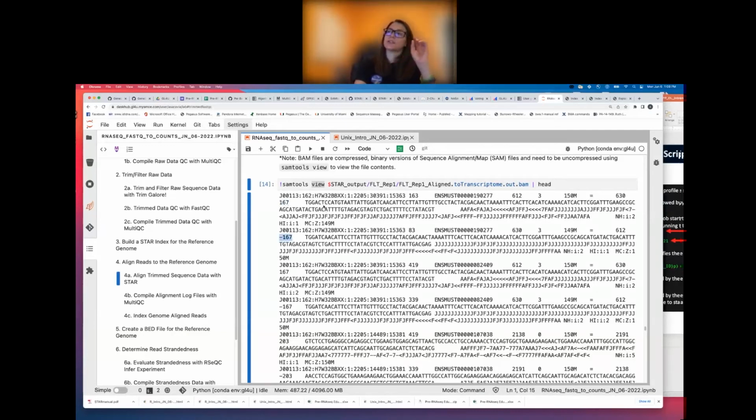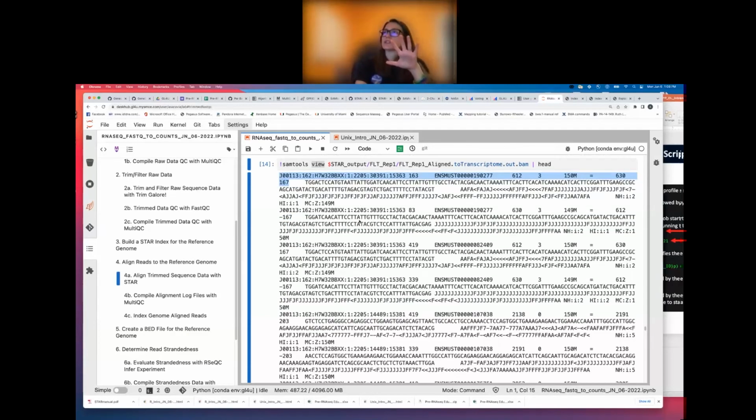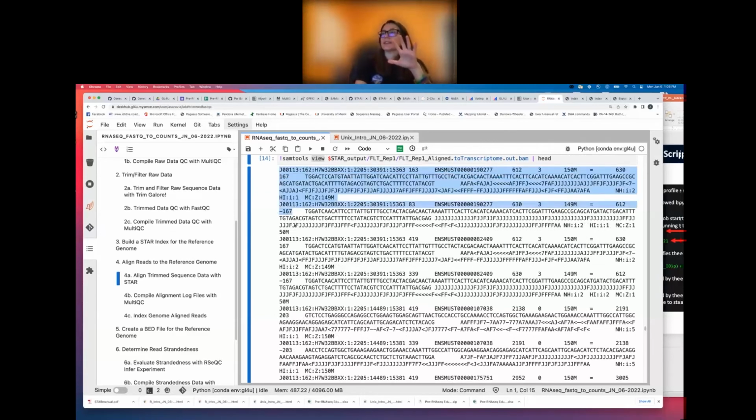If you want to do each read relative to the transcript, we know we have 5 transcripts here. And so we see 5 reads aligning in the same orientation as the transcript, right? This read is aligning in the positive, same orientation as this transcript, its mate pair aligning in the negative.